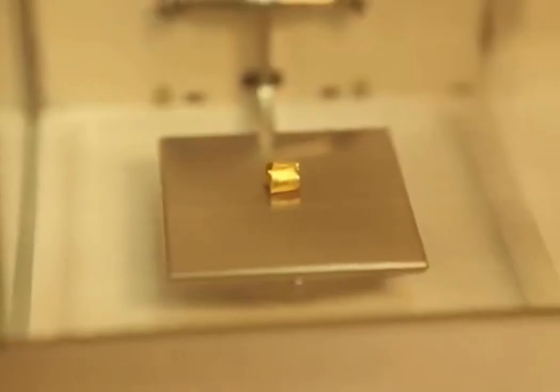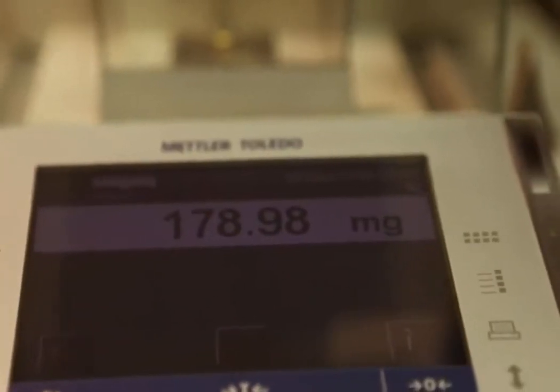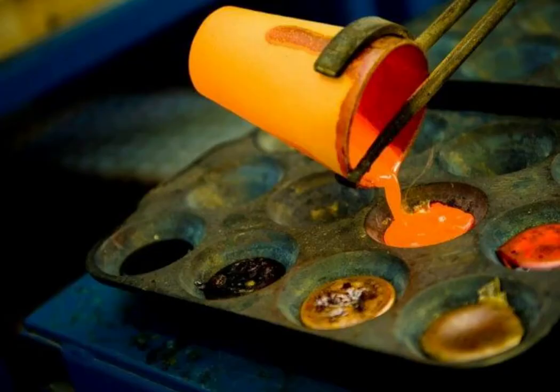The prill containing the precious metals is carefully weighed on a precision balance. The weight of the prill, along with additional analytical data such as the weight of the cupel and flux used, is then used to calculate the concentration of gold, silver, and PGMs in the original sample.